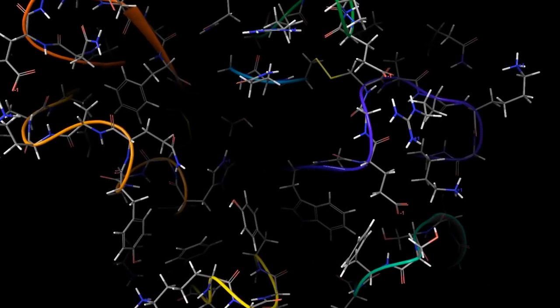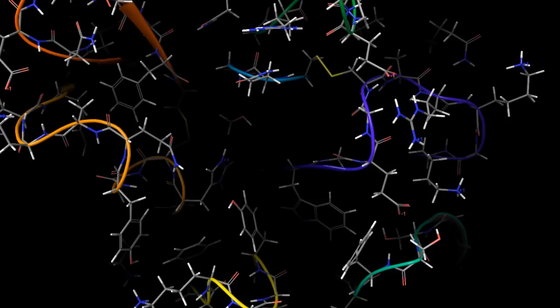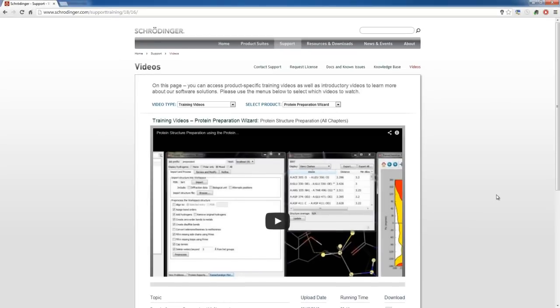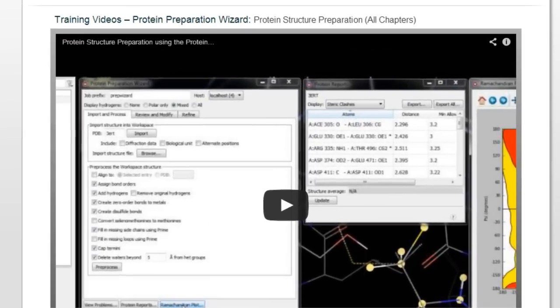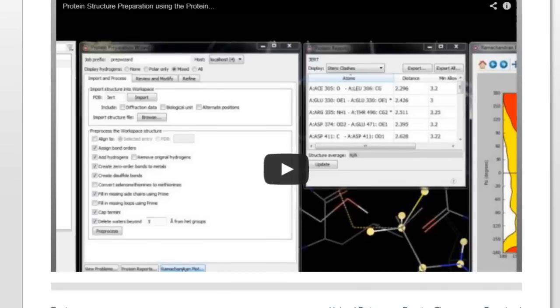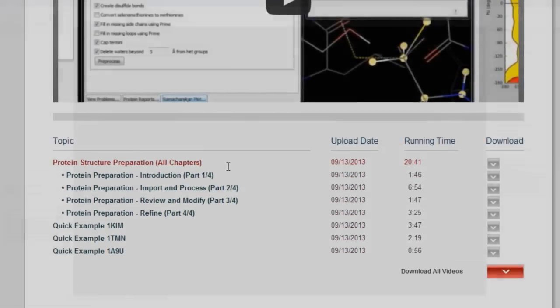Because receptor grid generation requires a prepared structure — i.e., an all-atom structure with appropriate bond orders and formal charges — we recommend first viewing the related videos on protein structure preparation using the protein preparation wizard.